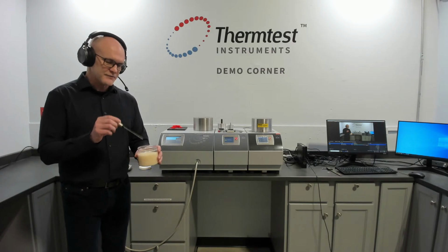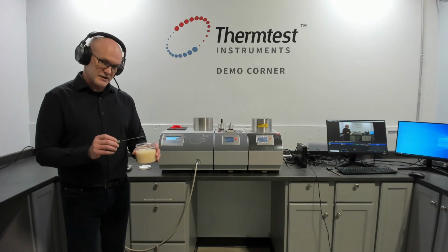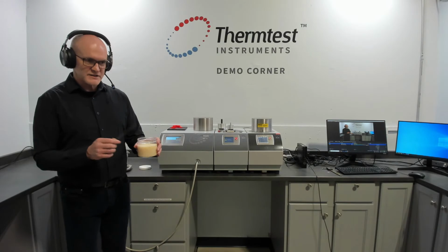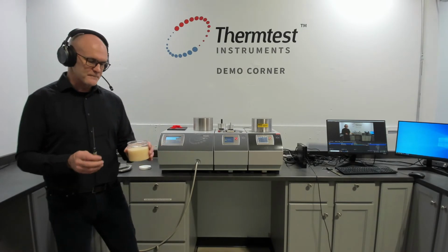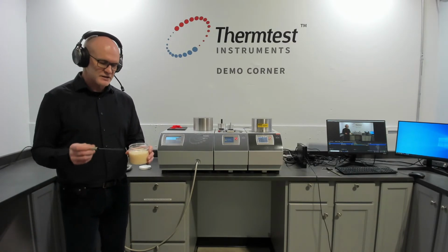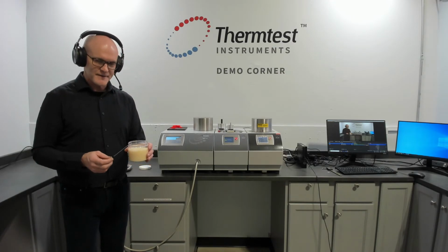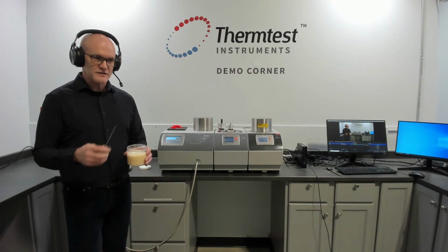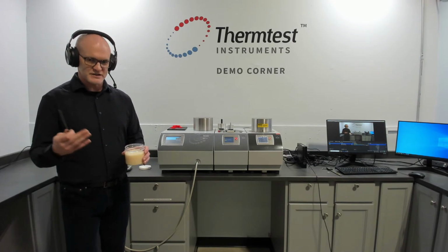So if there's any porosity left in that sample setup, you end up with data that is suspect. So you end up with errors in your data. And of course, convenience is important, but accuracy is most critical when you're using data in simulation. So the solution we were asked to provide was addressing the poor performance due to the porosity in the sample setup, as well as the inconvenience. And then the third was, we have a large amount of samples. Can you help us increase our throughput?